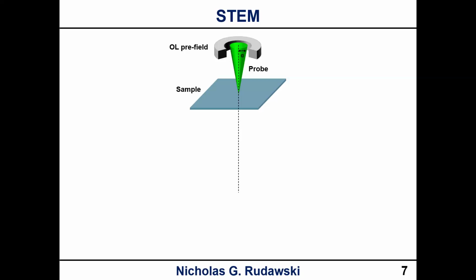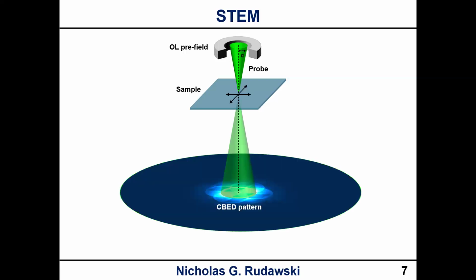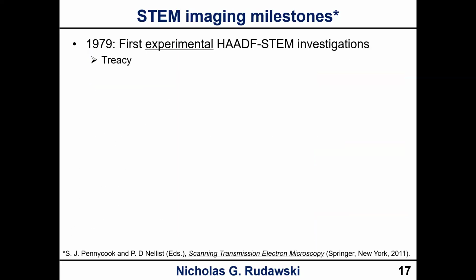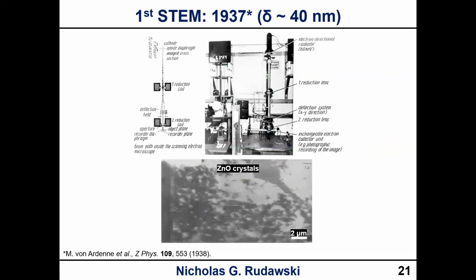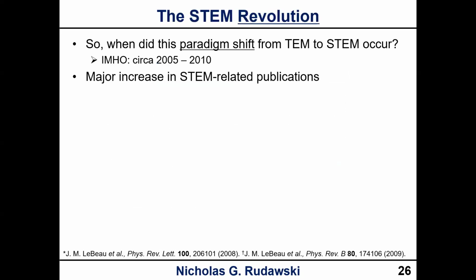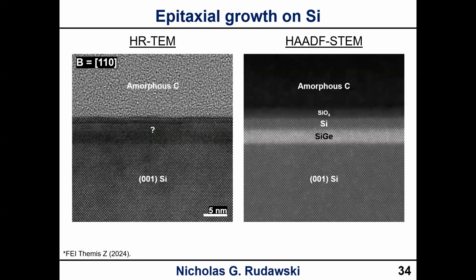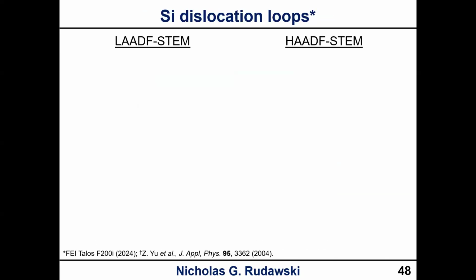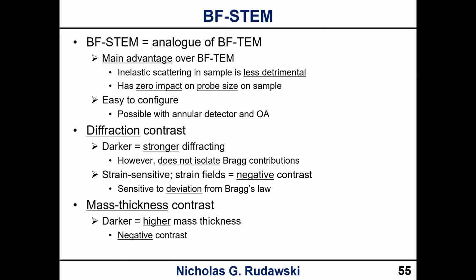So Lorentz mode is simply a type of DPC. So let me go back to the end here. Yes, and I apologize if I didn't clarify that well enough.